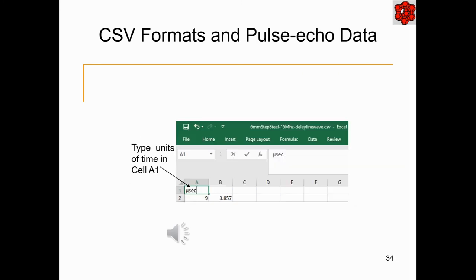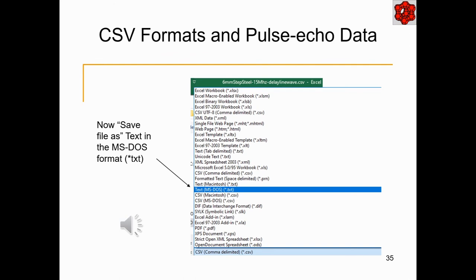Now in cell A1, we can write the unit of time, microseconds. When we move to the Excel save function, there is a large selection of file types that can be saved to. For MAPIS work, we will then save the file as an MS-DOS TXT file. The template can now be used to import the A-scan waveform in the same way we demonstrated for the original TXT file when importing the file in step 2 of the test description tab.